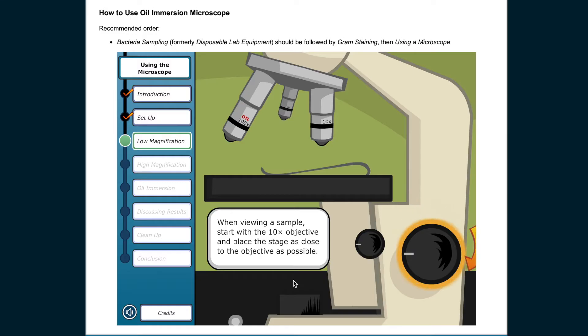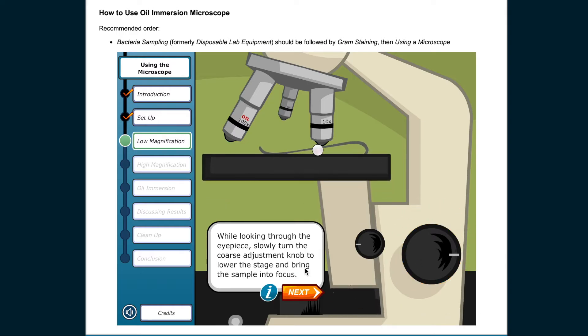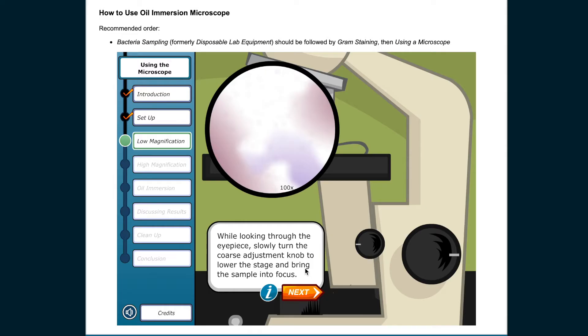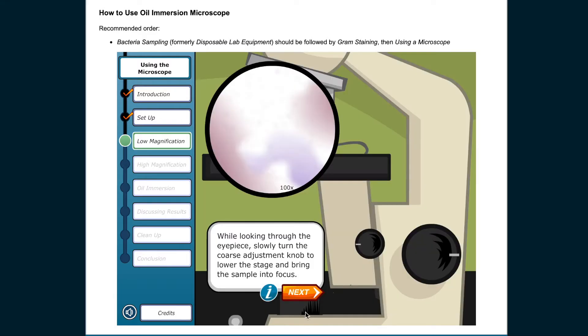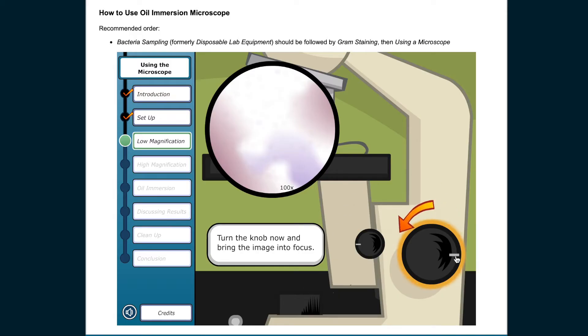When viewing a sample, start with the 10x objective and place the stage as close to the objective as possible. While looking through the eyepiece, slowly turn the coarse adjustment knob to lower the stage and bring the sample into focus. On some microscopes, the nose piece or objective moves when using the coarse and fine adjustment. Turn the knob now and bring the image into focus.